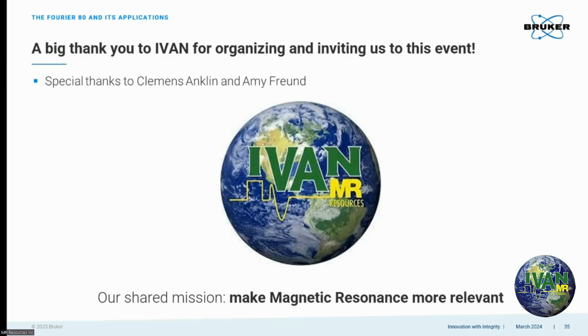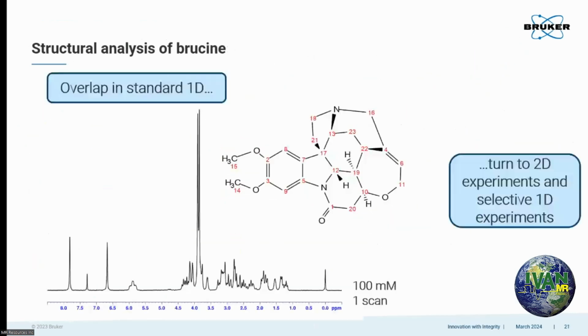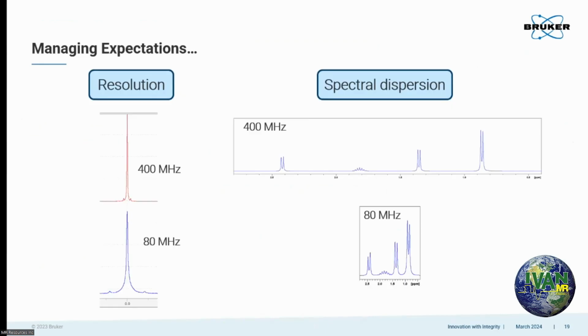You showed a line shape, high resolution versus benchtop. Can you give me some numbers for the line shape? I don't have a number off the top of my head, but the brucine, like this. No, I'm talking about the next one. Oh, so this is the TMS peak. What are the numbers there? Do you know? No, I don't, for the TMS. 50%, 0.55, 0.11. Okay. 0.11 is 50%. What about the 50% line width? LWHH, 0.4, I believe. 0.4 over 15, okay.